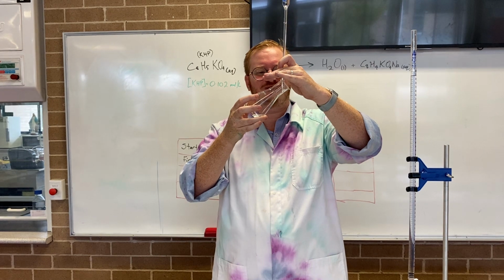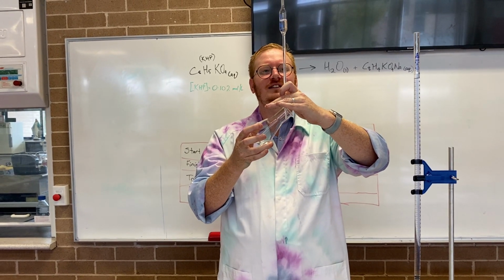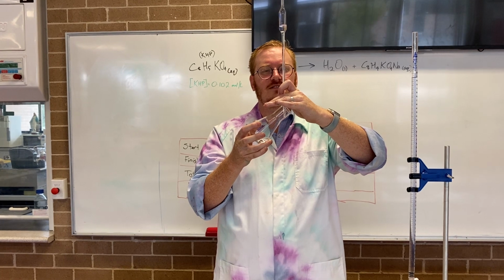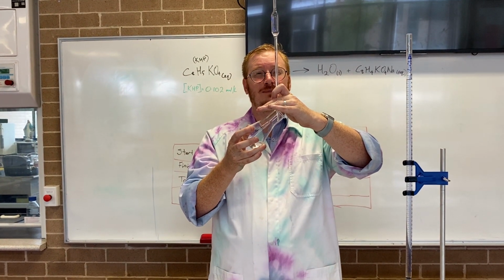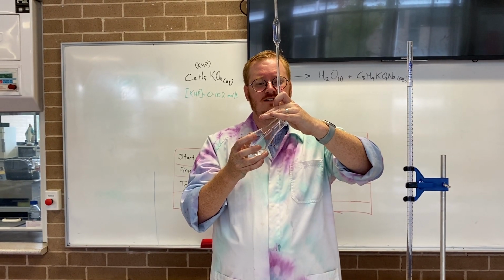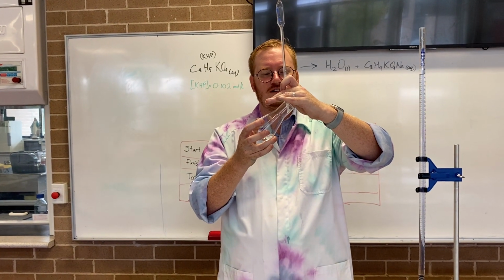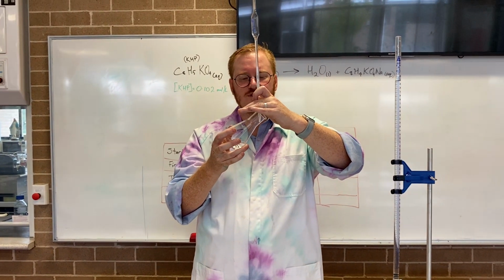It's hard to do it and also show. There we go. Always tend to do chemistry at eye level. Lift things up, never lean down. It's much more dangerous to kneel, don't know what's on the floor, and also if something spills, it's going to spill right in your face. Okay, it's going down. It's near the tip. There we go. A couple more seconds and I can guarantee that I've got that 25.0 mil in there.